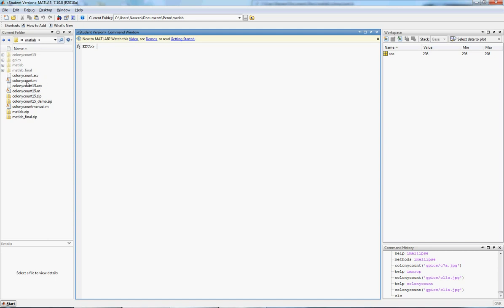So to begin with, you want to make sure that you have the right file in the current folder that you're in for MATLAB. Colony Count is over here.